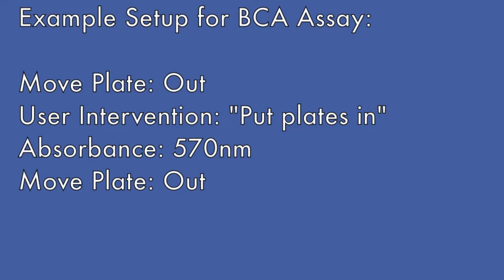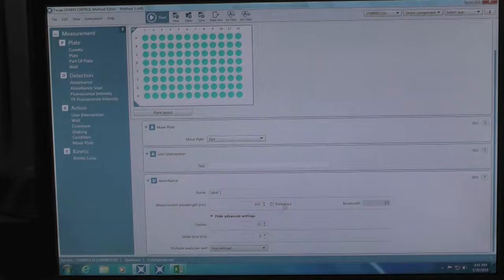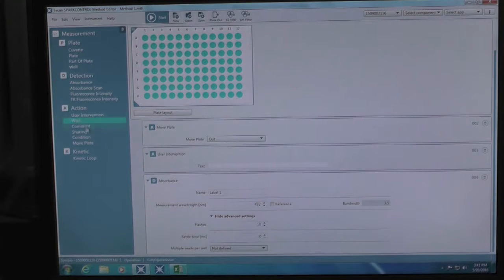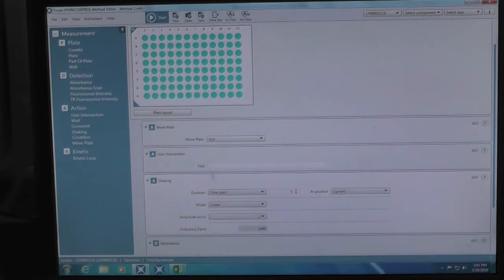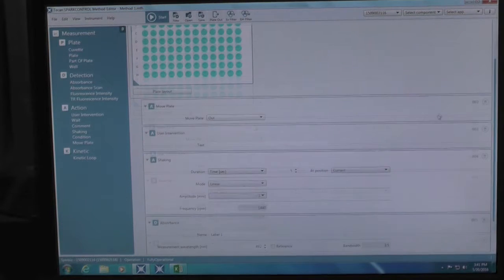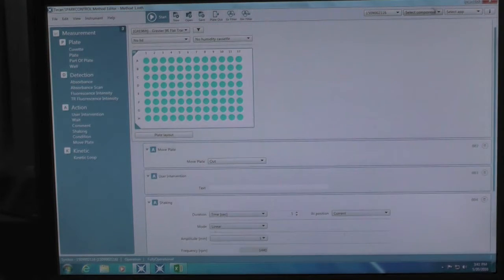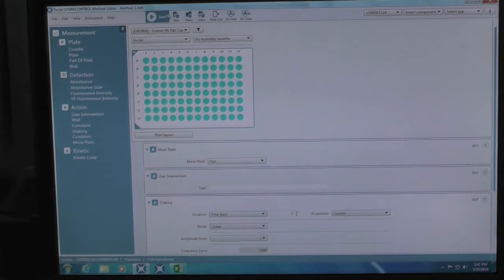In this example, we want to set up a program to read absorbance. So, we drag the absorbance command and drop onto the main program area. Type in the correct wavelength for your assay. In this case, 570 nanometers. If you wish, you may also add in a shaking action.